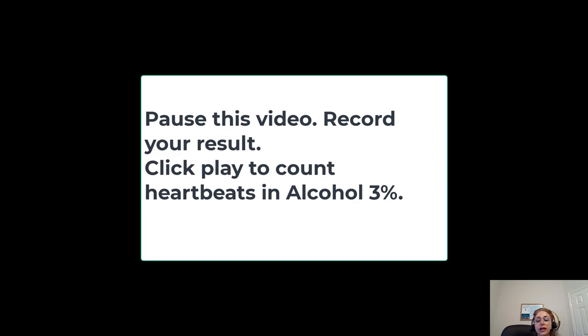Now you need to pause this video, record your result, and then click play to count heartbeats in alcohol 3%.